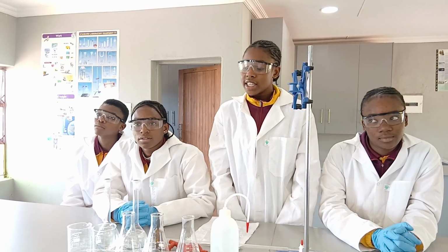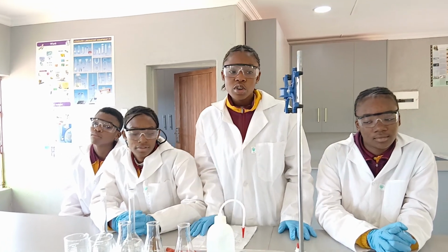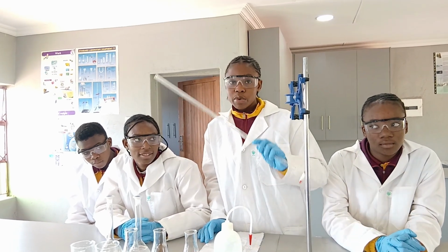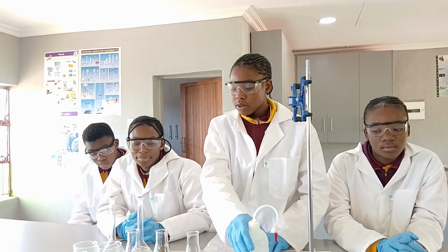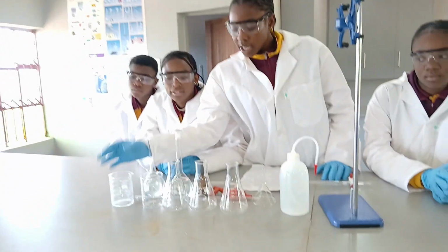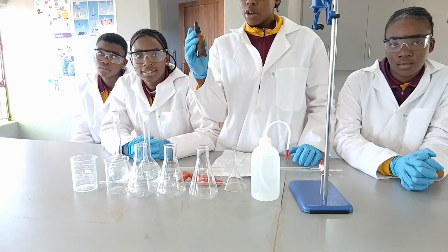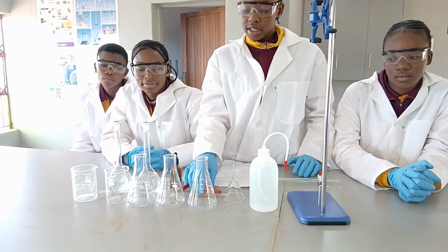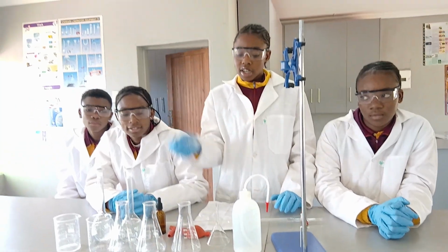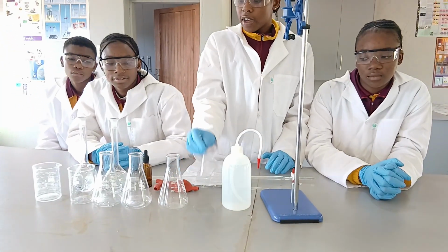Today, these are the equipment that we're going to use. Here we have a burette stand. Here we have a burette. This is a wash bottle, and these are conical flasks. We also have beakers, and we have a phenolphthalein indicator. This is a pipette safety valve. This is a pipette, and this is a funnel.